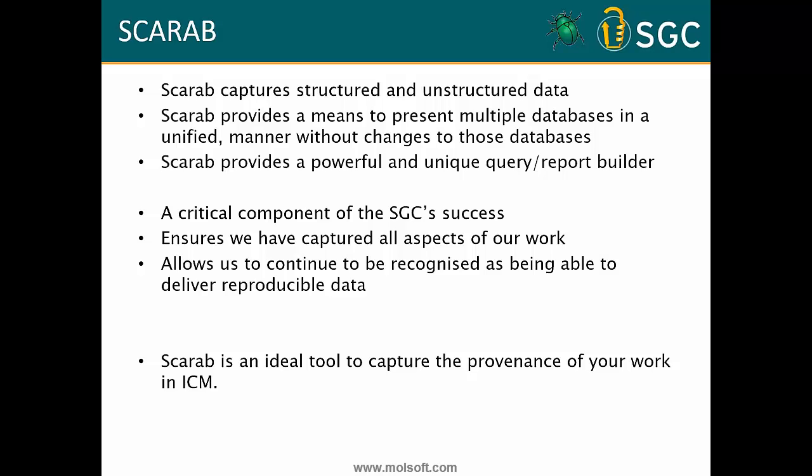And I think in industry, where you may have legacy databases that are just sitting there and everyone's terrified of playing with, this is a really good way of being able to connect to that database and seamlessly, or at least transparently, connect multiple databases together without actually modifying the databases underneath. A classic example is ChEMBL.